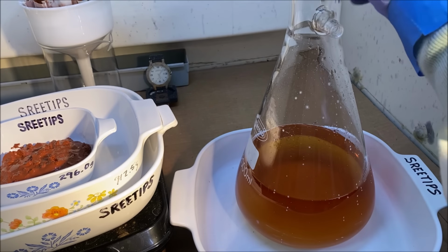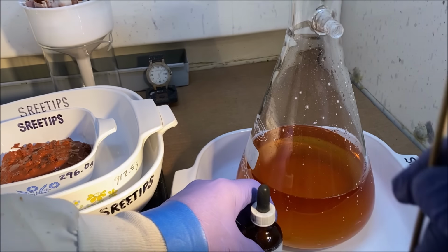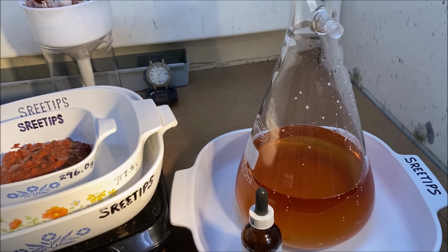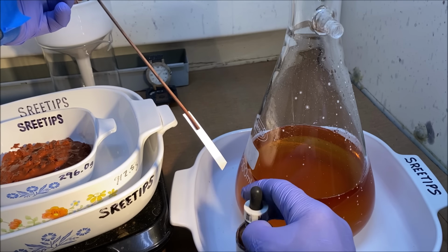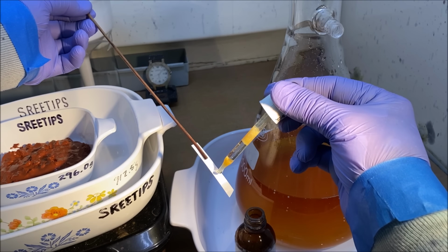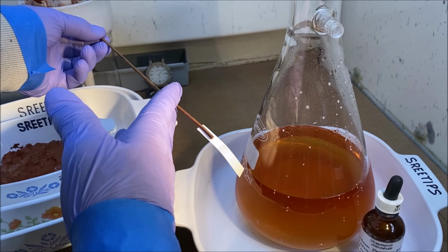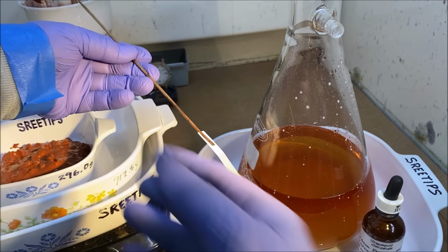Let's take a look at what we got in this flask. This is our waste solution that we filtered off. I'm going to get down in here and get a little bit of it on a piece of filter paper. We're going to test this, see what kind of metals we have in solution here. Not a whole lot. Not a whole lot of material in solution.